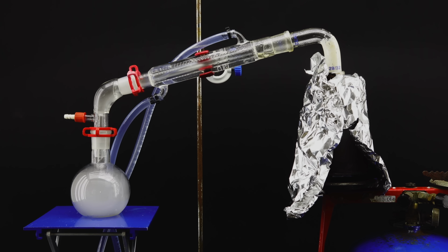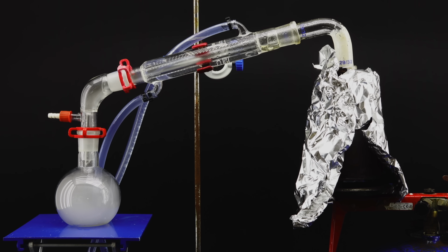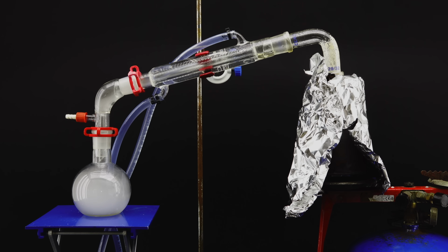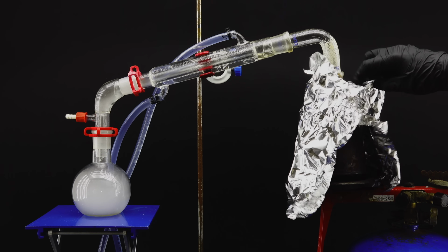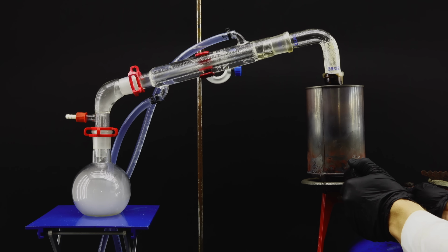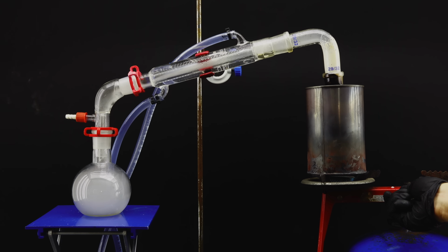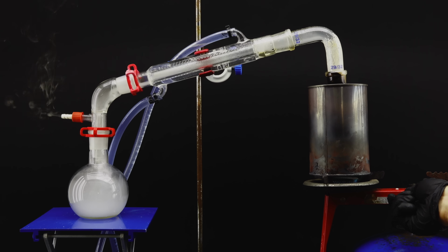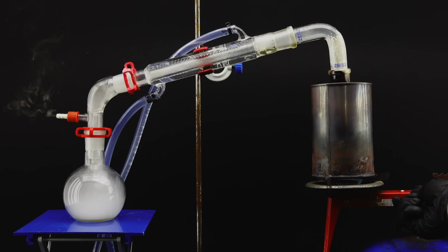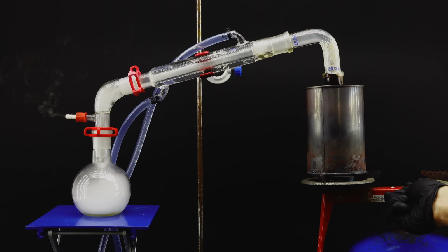I was honestly dumbfounded and didn't quite know what to do, however, I really didn't want to give up on this project. As a kind of last resort move to try taming the foam, I got rid of the aluminum foil I originally insulated the can with and again turned on the stove, this time cranking it all the way. It somehow worked, and even with everything vigorously boiling, no foam seemed to appear. This whole thing seemed quite weird, however, I decided to simply not think about it and just move on, since now the reaction seemed to be picking up.